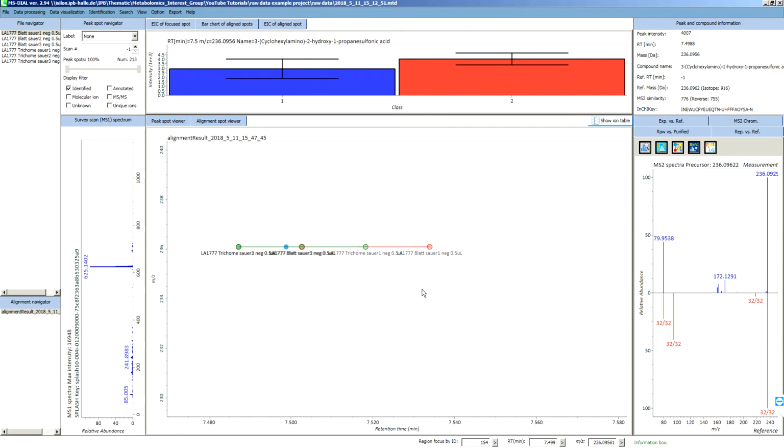you can see how the extracted features of all 6 samples are connected to one center point. The center value is the average mass of all measured masses and the average retention time of all measured retention times. Green spot is associated with the detected flag, showing whether all samples contain the spot. Red spot is associated with the interpolated flag, showing whether the software augmented originally missing values.